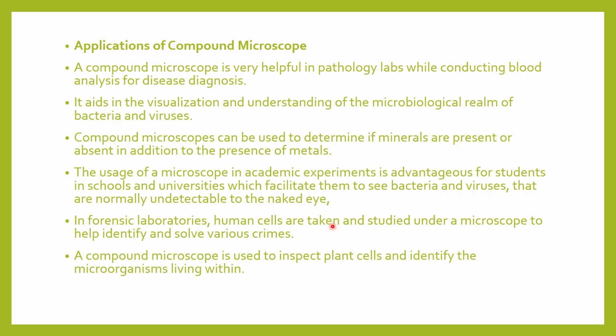Yes, we also use it in school and college laboratories. We make students see the bacteria and viruses which we cannot see with our naked eyes. And apart from that, it is also used in forensic laboratories, where human cells are studied under the microscope. Apart from that, we can also use it for observing and visualizing plant cells, and identifying the organisms present within them.